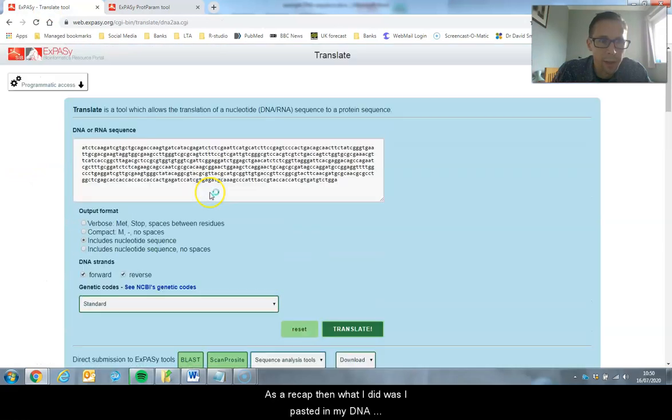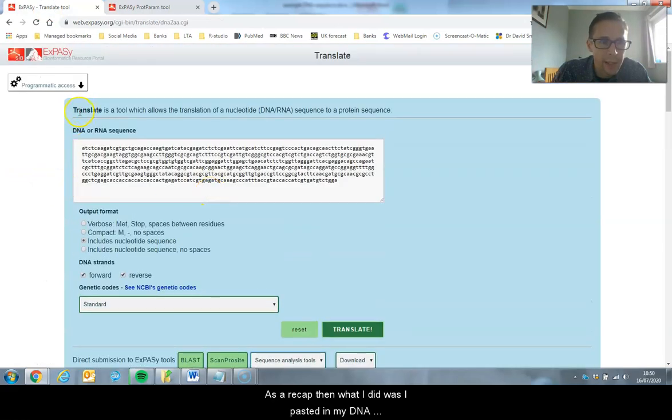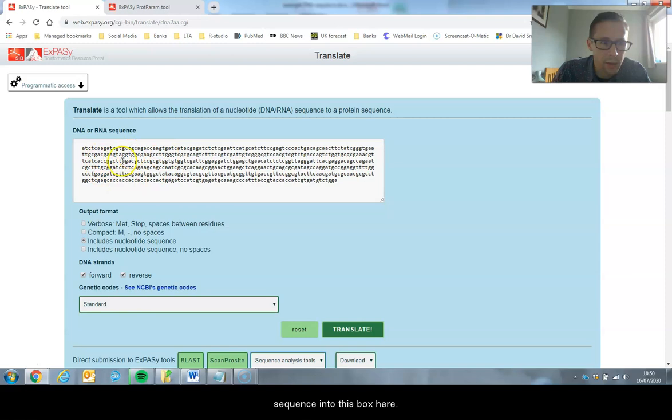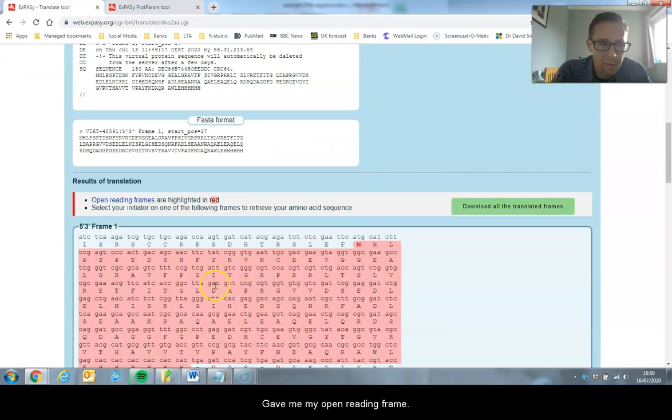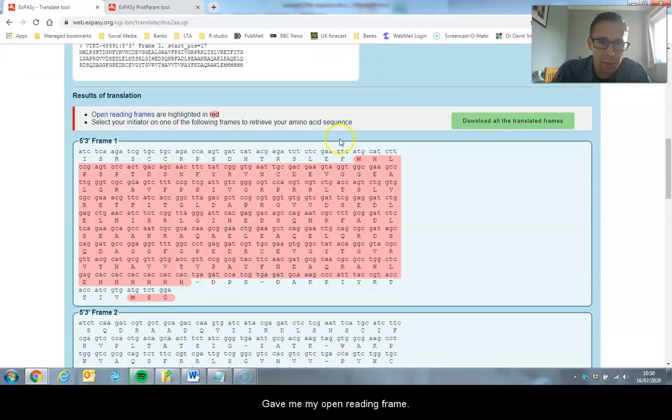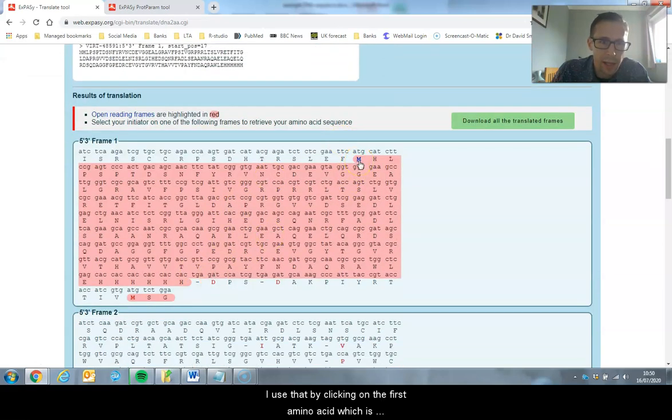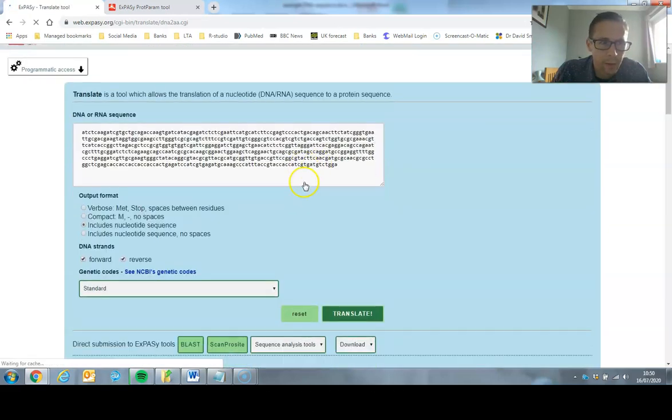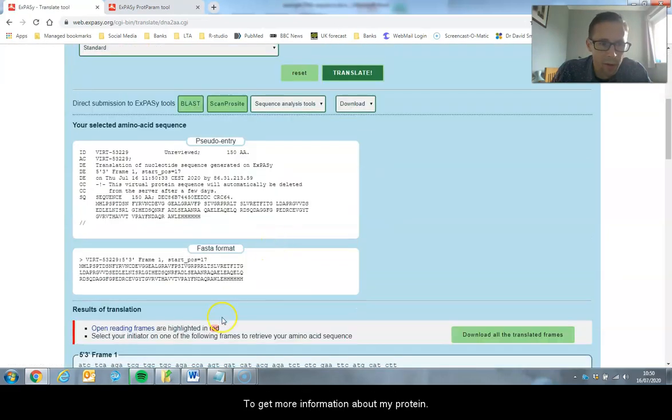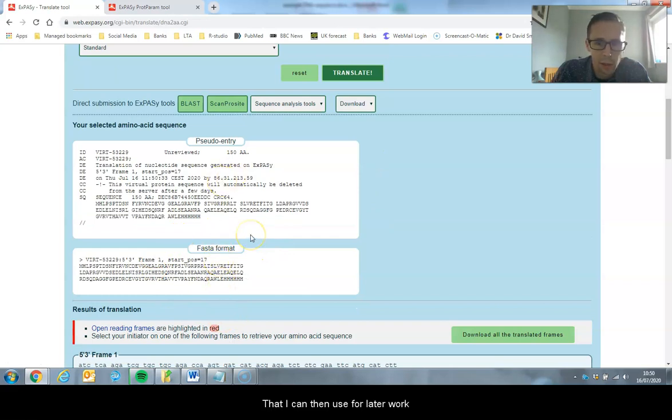As a recap, what I did was I pasted in my DNA sequence into this box here. I clicked the translate tool. That gave me my open reading frame, and I used that by clicking on the first amino acid, which is always methionine, to get more information about my protein that I can then use for later analysis.